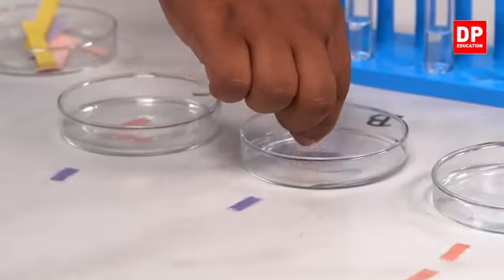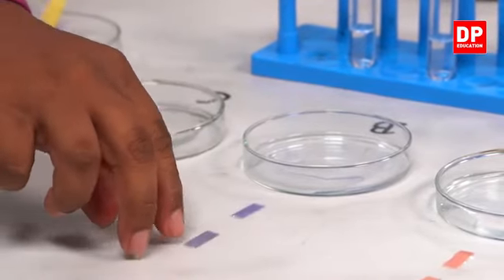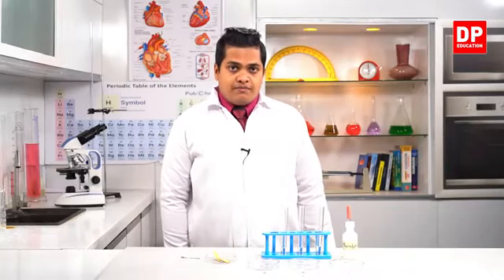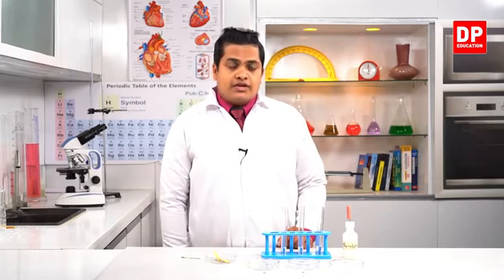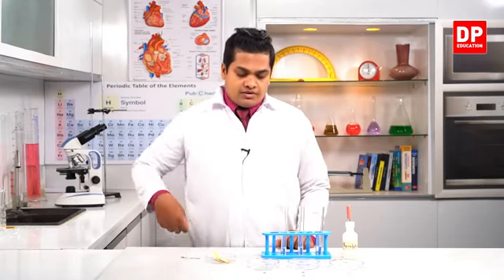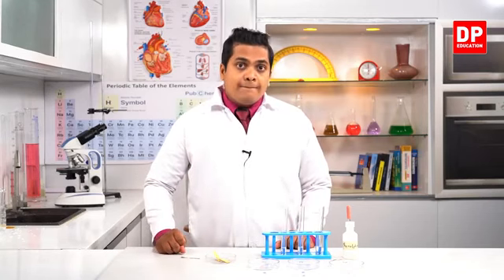Red litmus has turned into blue color. See, red litmus has turned into blue color. Red has turned to blue color with the presence of a base. So you know that B solution contains sodium hydroxide, which is a strong base. But here, up to a certain level, we have diluted it, right? However, it contains a base. So therefore, red litmus is getting converted into blue color with the presence of a base.